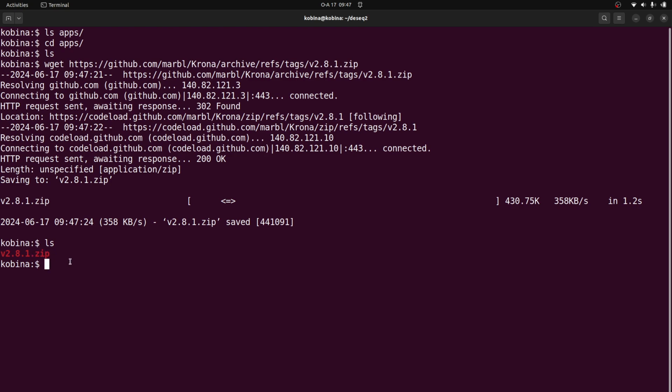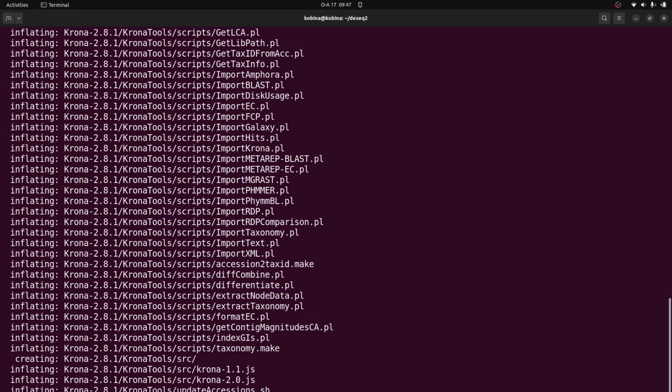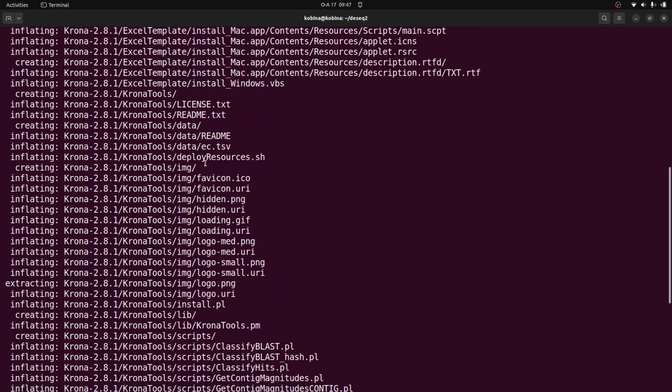All right. Now let's unzip it. We are going to unzip. So I'll say unzip and I'll specify the file and unzip it. It's very simple. The unzip command is this one, this very one here. All right, that's it. That's what I just did. And then I see that everything has been unzipped for me. That's why we see all these paths.